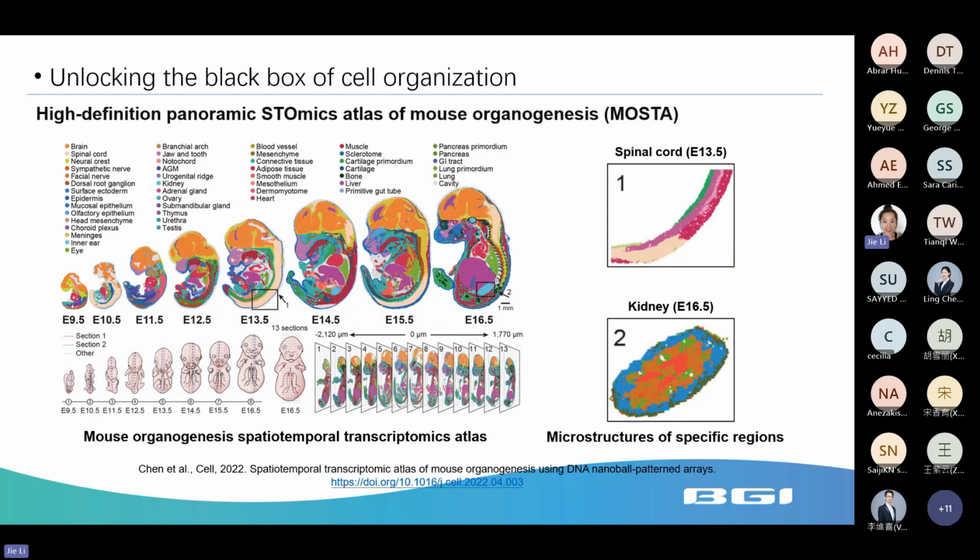In this paper, the tissue was from mouse brain, embryo, and olfactory bulbs. The brain and olfactory bulbs were from 12-week-old female mice, and the mouse embryos were at 8 different time points of development.